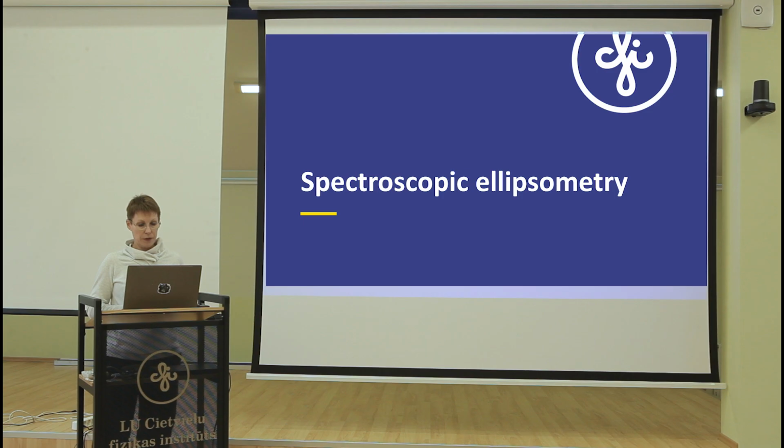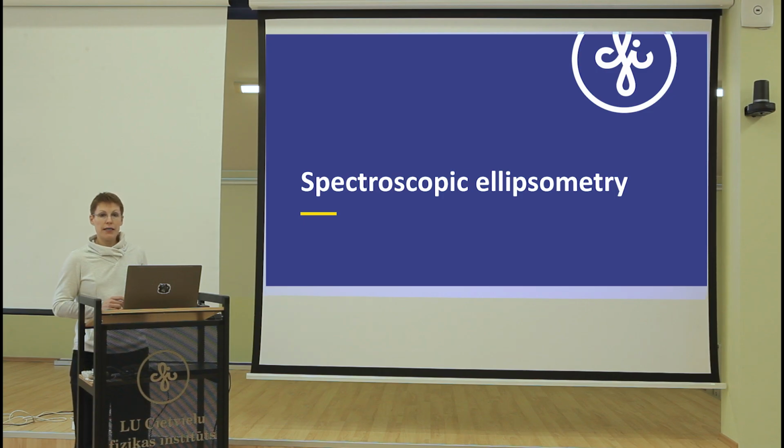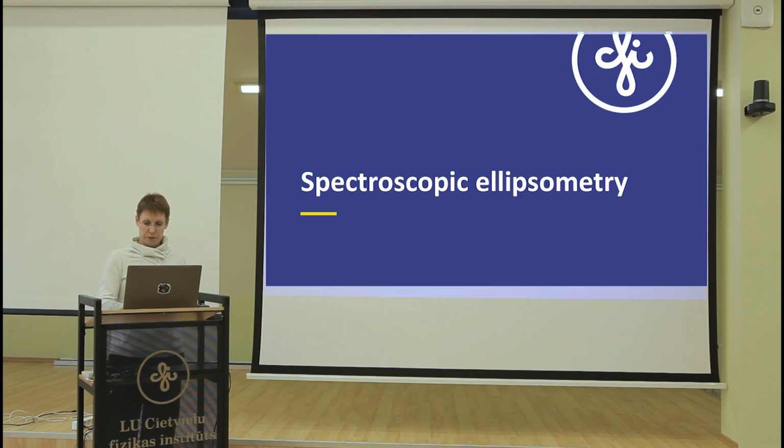Here, ellipsometry offers a non-destructive way to assess film quality and present in detail the properties of the film, which can become a very valuable tool for optimizing sputtering parameters to achieve higher quality films. So now let's see what is spectroscopic ellipsometry.